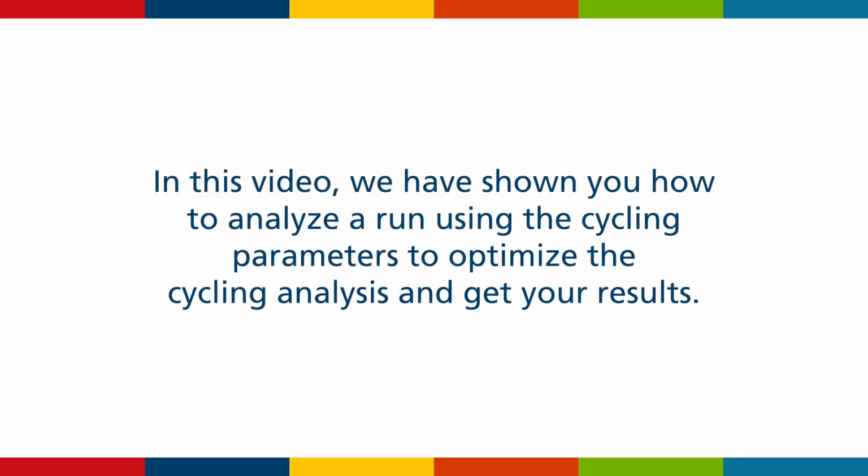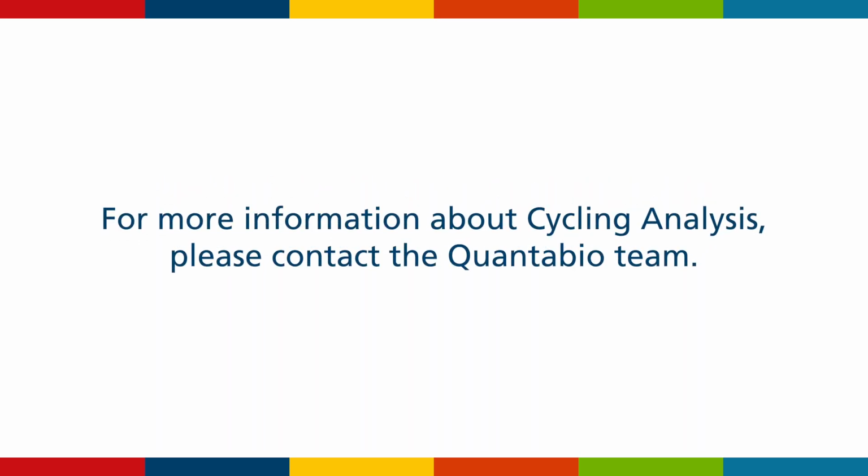In this video, we have shown you how to analyze a run using the cycling parameters to optimize the cycling analysis and get your results. For more information about cycling analysis, please contact the QuantaBio team.